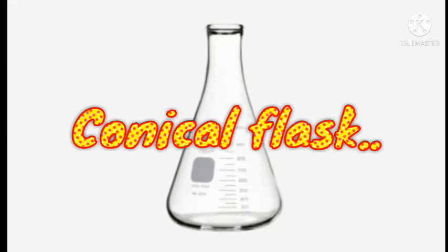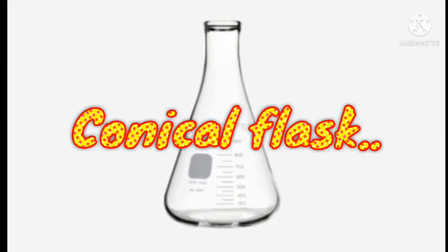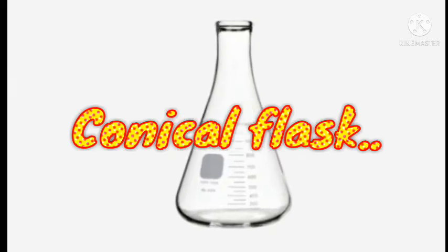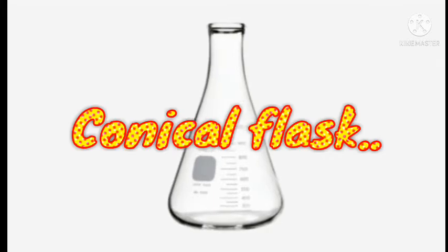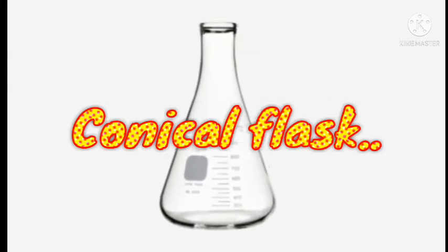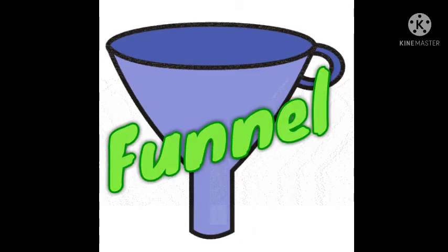Next, the conical flask. A typical conical flask is used to mix and heat up solutions during an experiment. The funnel is used to channel liquids into containers with a small opening.